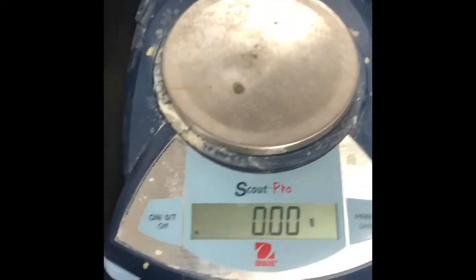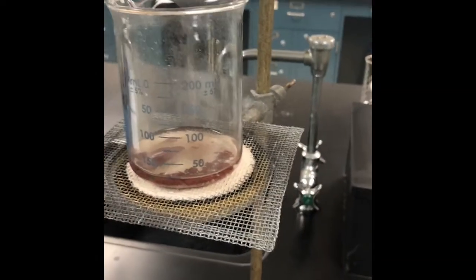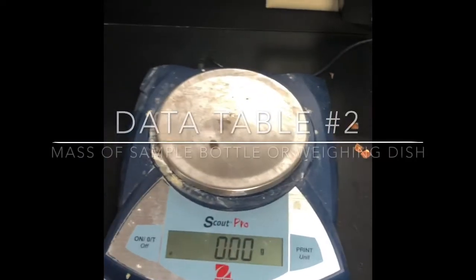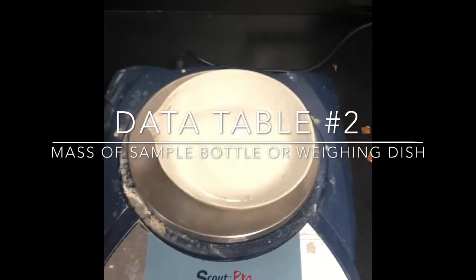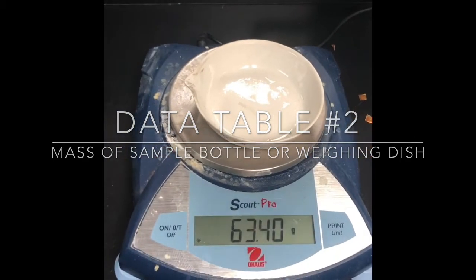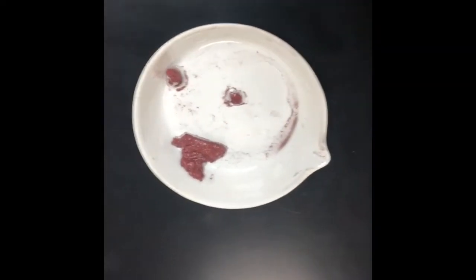Okay, so as my mixture has warmed up, we're going to measure out the mass of a porcelain evaporating dish. So we're going to use an evaporating dish. Looks like that. You need to record this mass. It's 63.40 grams.